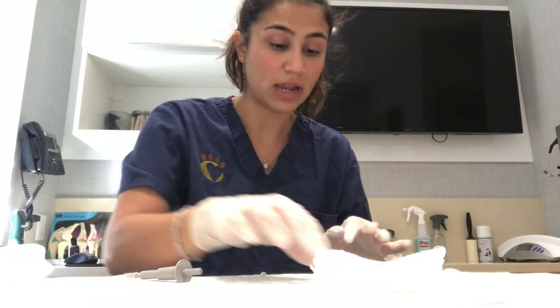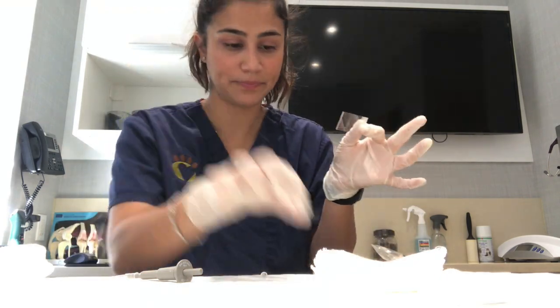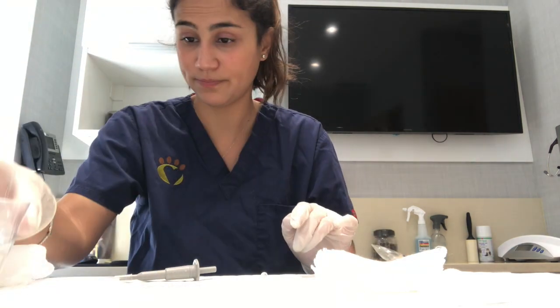Okay, so next up we'll be doing a direct smear. This is very, very simple. I actually don't need to centrifuge it or anything. So the items I'll be using today are a slide and a cover slip. I'm also using a pipette end to get my feces and my fecal flotation solution.